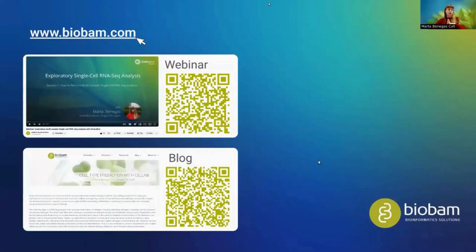So, as some concluding remarks, I think that these examples effectively show the importance of choosing the right reference to perform the annotation. We've seen that with CellKB, we achieve reliable annotations, but without the need of looking for that reference in databases. And I hope that this short walkthrough through the platform has demonstrated how easy and intuitive it is to perform cell annotation with OmicsBox. I encourage you again to take a look into my previous webinar, where I covered all the steps of the full single cell analysis pipeline.